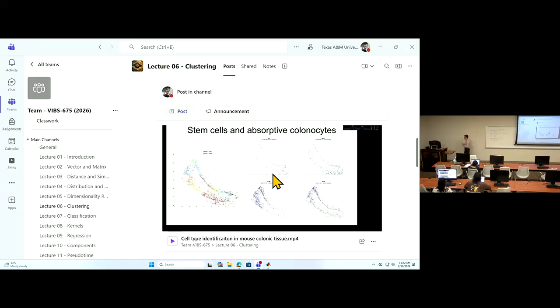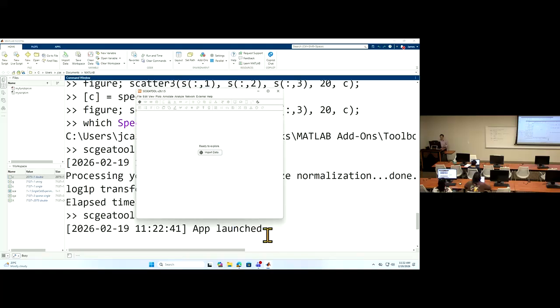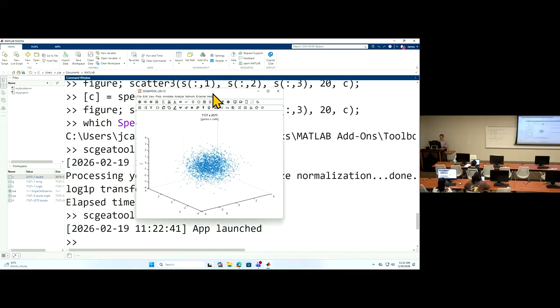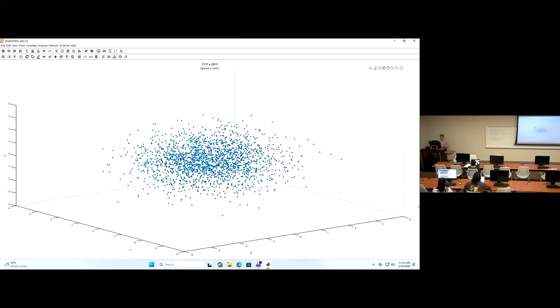Okay. I hope it answers a lot of your questions, and I will come back to examples. Let's do one example here. So let's load this example data which is not processed yet. So let me change this color. Okay.